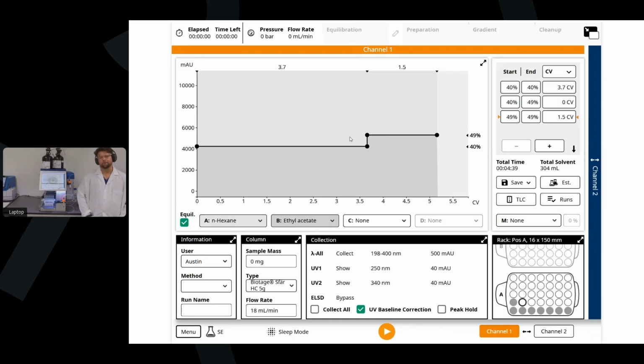Our next viewer question is a little broad, so I think they want you to elaborate more. All right. They're asking, can you talk a bit more about the ELSD?